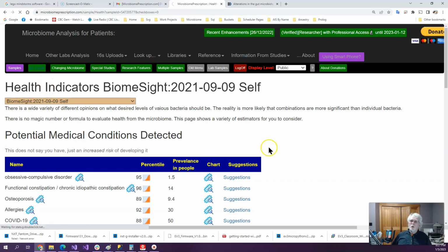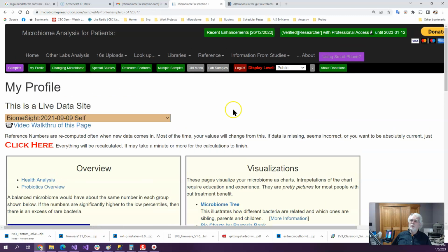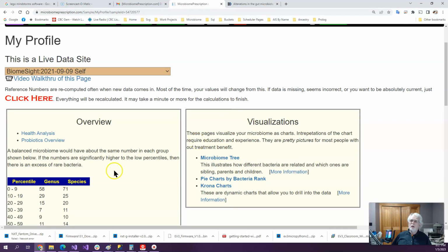Okay, let's go back to my profile. We have just gone through one of the many things, and there's a ton of information on the site. So I'm going to double click. There we go. Usually doesn't take that long.